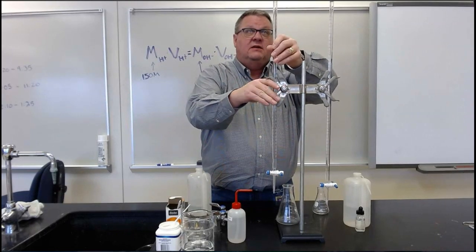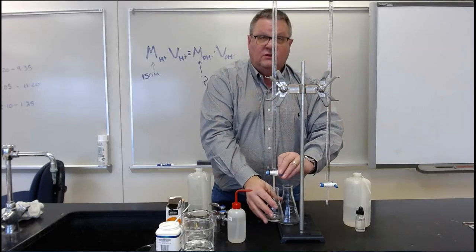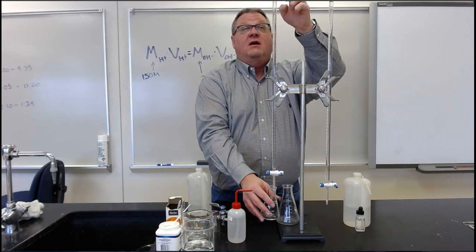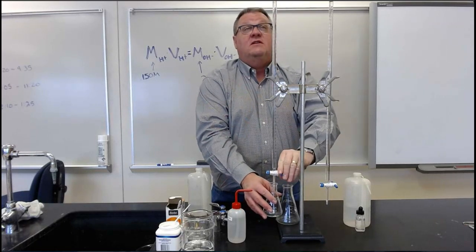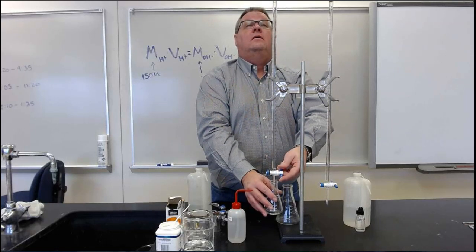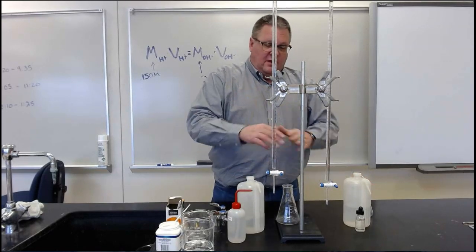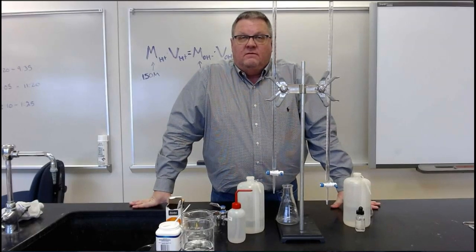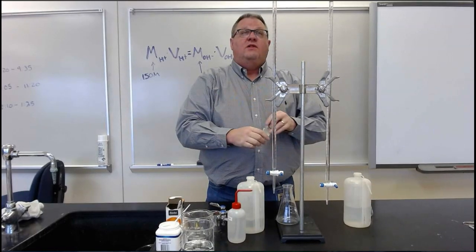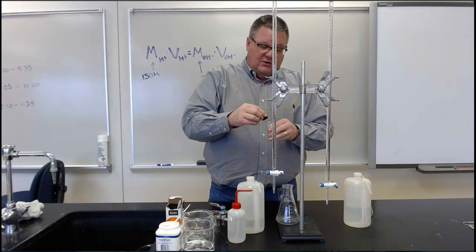Get it inside, attached with the burette clamp here. Use my waste burette. I'm going to slowly drain some base out of here till I get my meniscus up on top here to the 0.00 milliliter mark. Touch off the drop. Okay? This will be done for you in the virtual lab that you're going to be doing. So they'll start you out with your acid and your base. You'll be able to see it very clearly at the 0 mark.